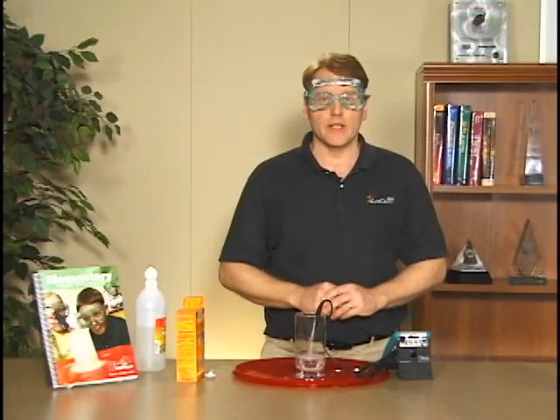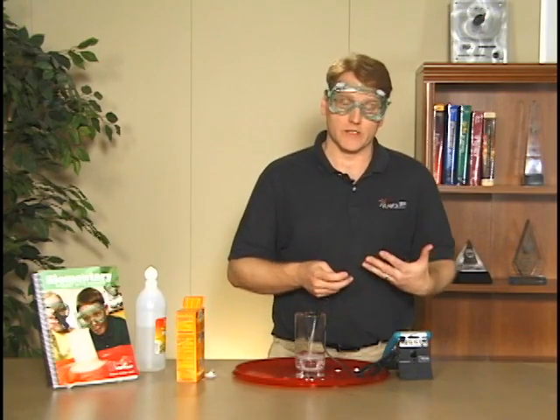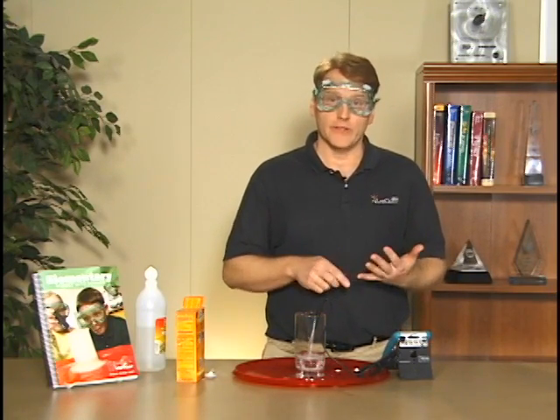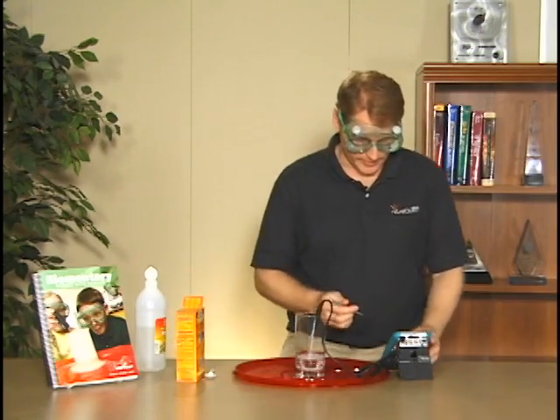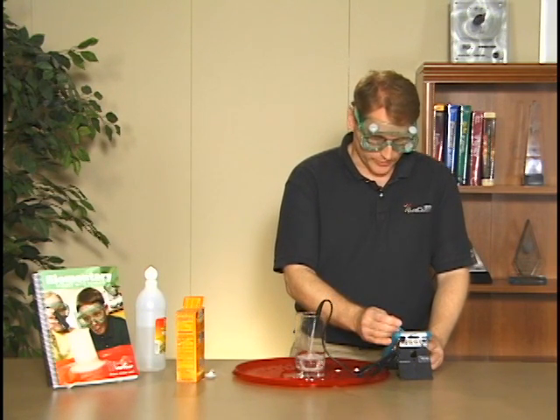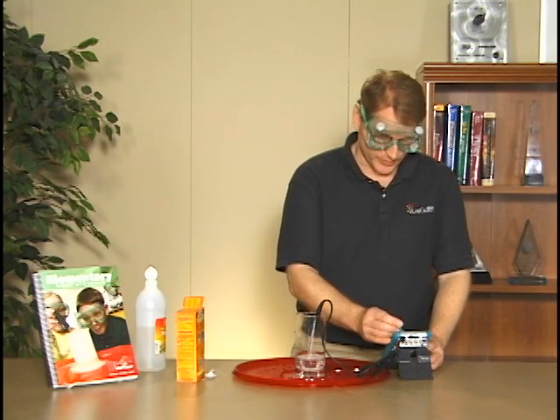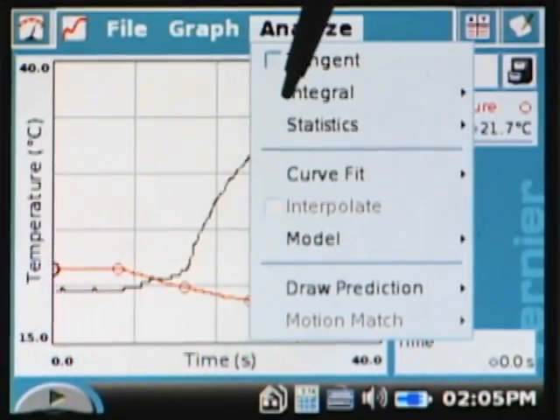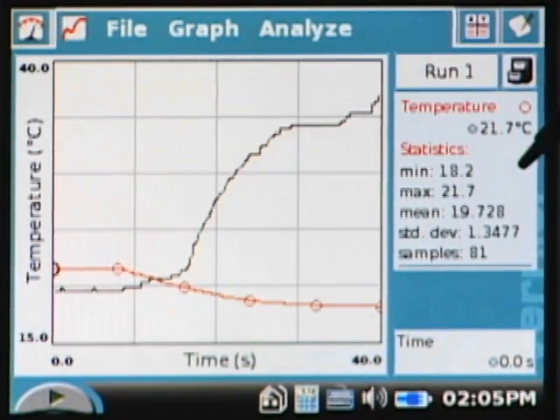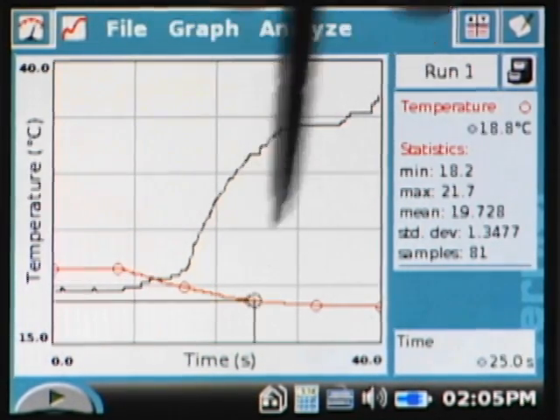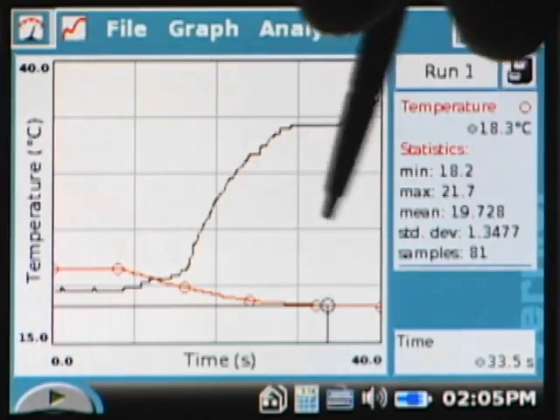It stopped collection. What the lab asks the students to do now is to go in and do some analysis. Concepts like minimum and maximum are covered here, so some mathematical concepts are coming into this. I can do some statistics—I'm going to go to Analyze and we go to Statistics. Over on the right side of the screen we see the minimum temperature was 18.2, the maximum was 21.7. We can even move along our graph and actually find the values at different points in time if we want to.